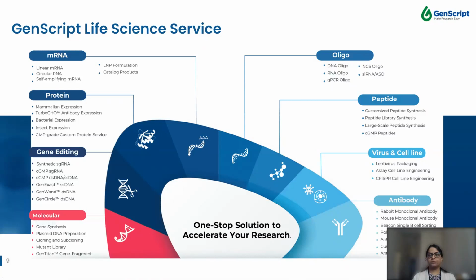As noted in the previous slide, the discovery of cell therapy involves numerous crucial steps, such as target identification and validation, CAR optimization, and many others. And each of these steps can be addressed using various tools. For example, at the discovery stage, target genes are often validated using CRISPR for gain or loss of function studies to understand the target gene function in biology and disease.